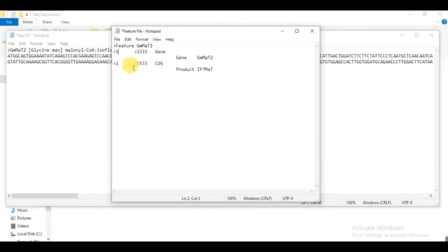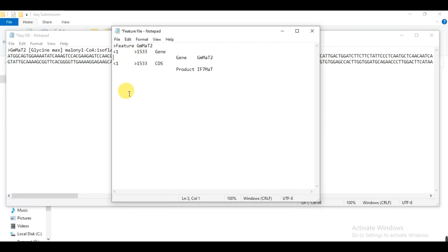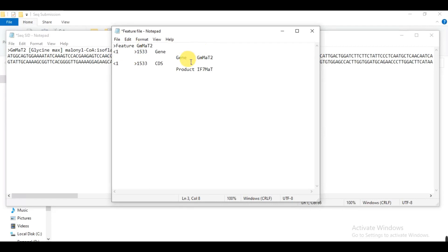After writing the start position, press tab, then write greater-than and how many base pairs it has — but remember, do not count the stop codon. Without the stop codon, how many base pairs does it have? My gene has 1533 base pairs. Then press tab and write 'gene'. On the next row, press tab three times and then write 'gene' or 'CDS', then another tab and write the name of that gene.